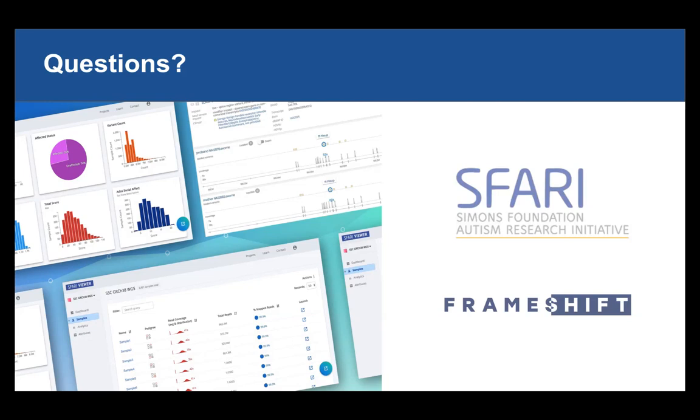And again, it's a real-time application that connects directly to the data files and generates distributions and information in real time as you watch, and gives you a good idea of whether the data for a single sample is good. We also have a tool that's called Multibam that allows us to look at these same sequencing quality metrics, but across a whole cohort.